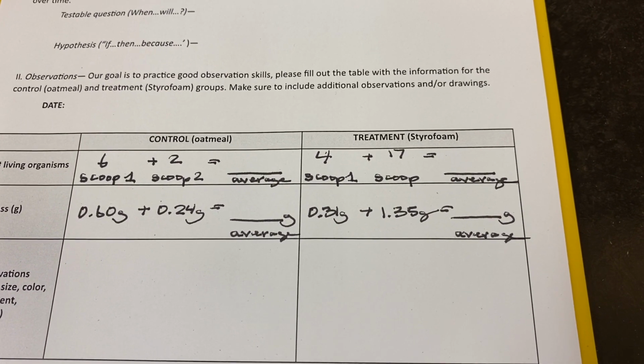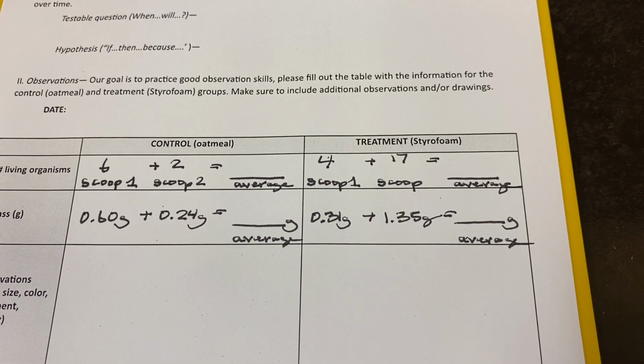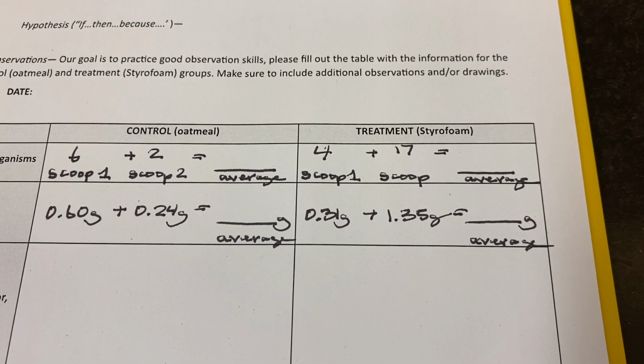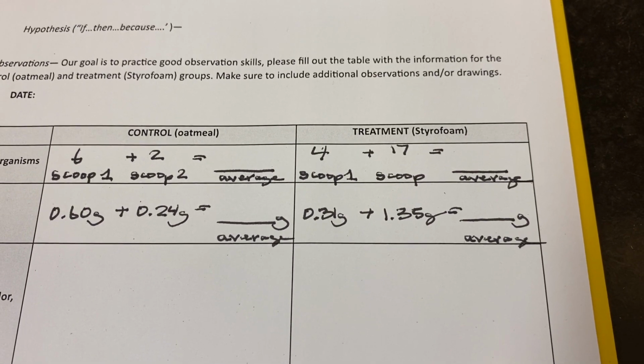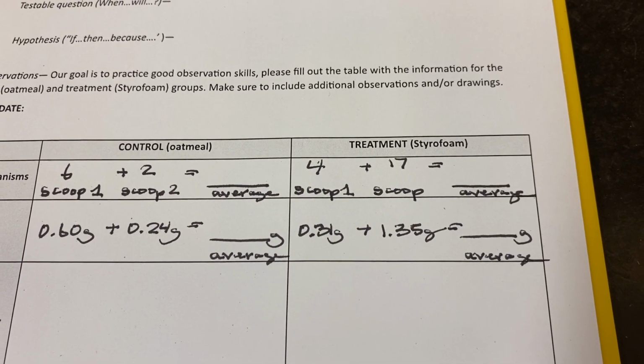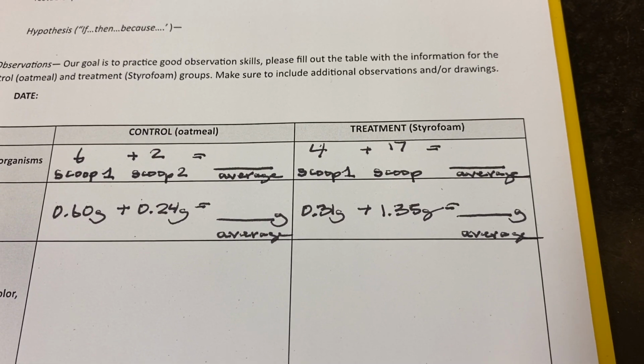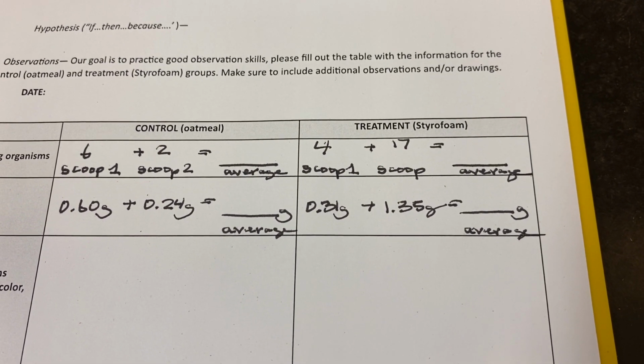Below that will be the mass of the scoop number 1 mealworms is 0.31 grams. The mass of scoop number 2 was 1.35 grams. We want to sum those and divide by 2. That becomes the mass of an individual mealworm on November the 25th that was fed styrofoam.